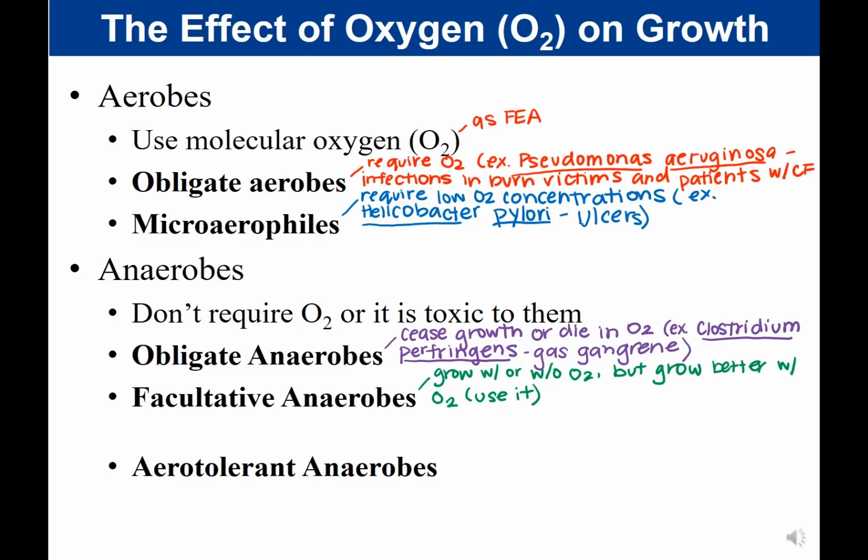So an example of this is E. coli, Escherichia coli. You can write out Escherichia, you've seen it many times. E. coli, for example, is the cause of urinary tract infections. About 90% of all urinary tract infections, what we call UTIs, are caused by E. coli.